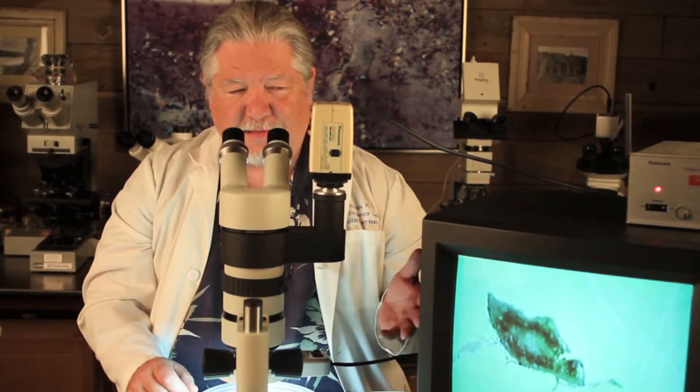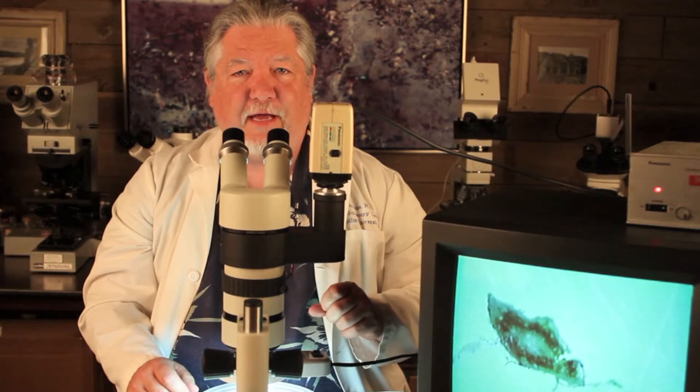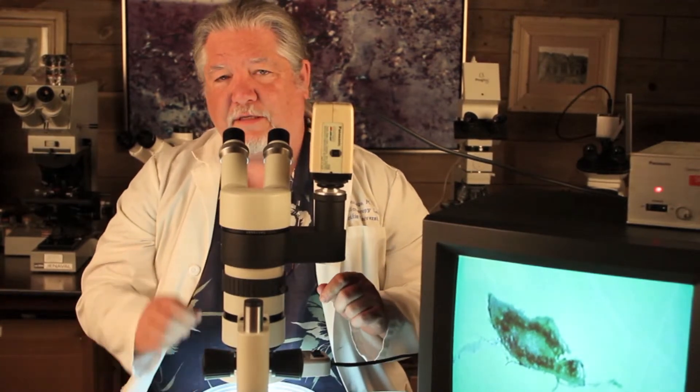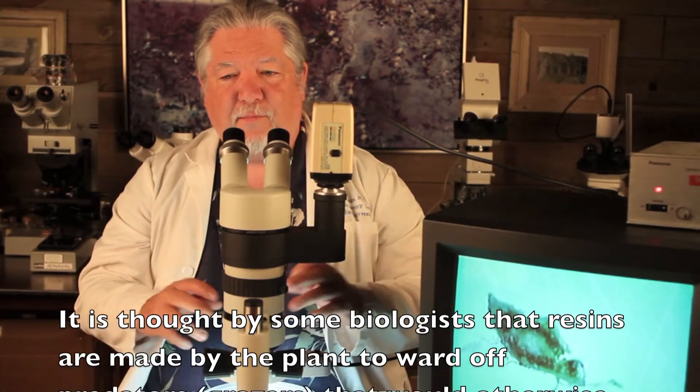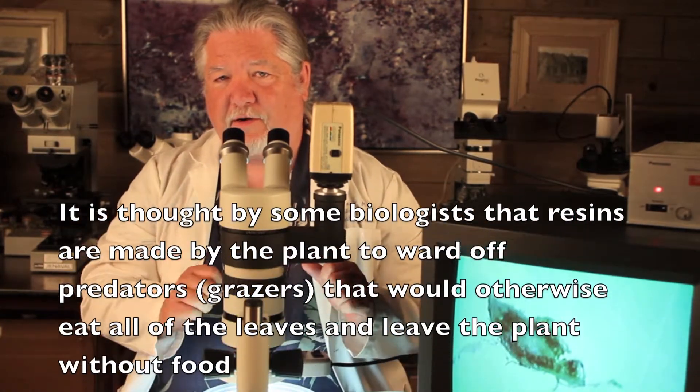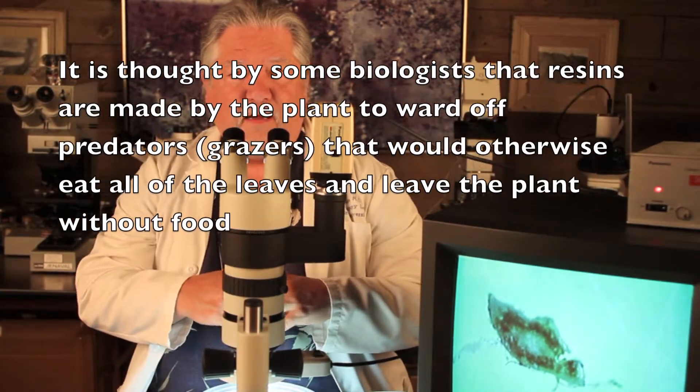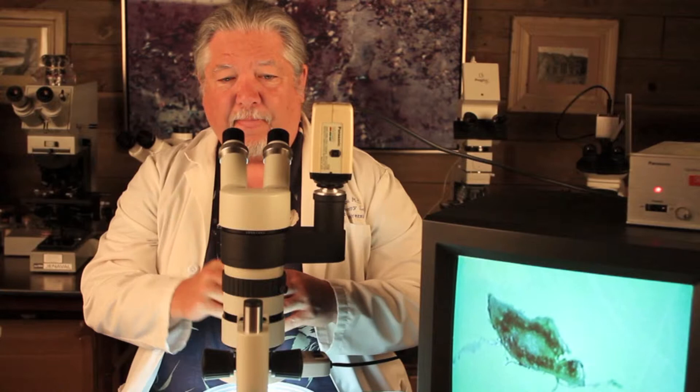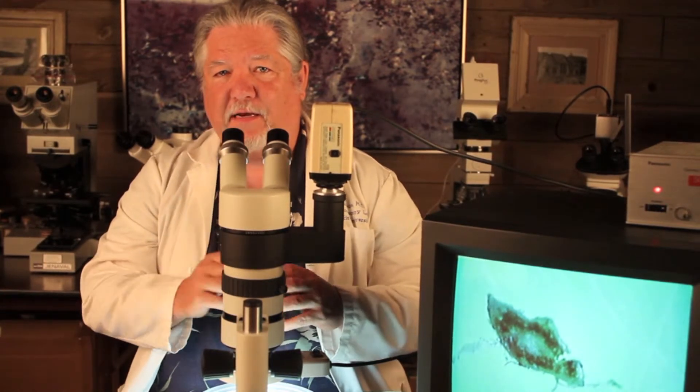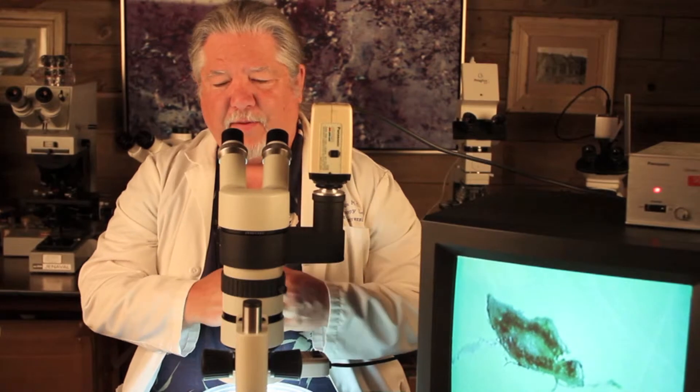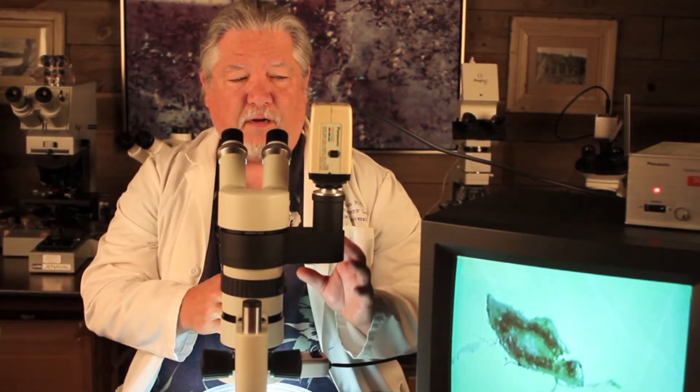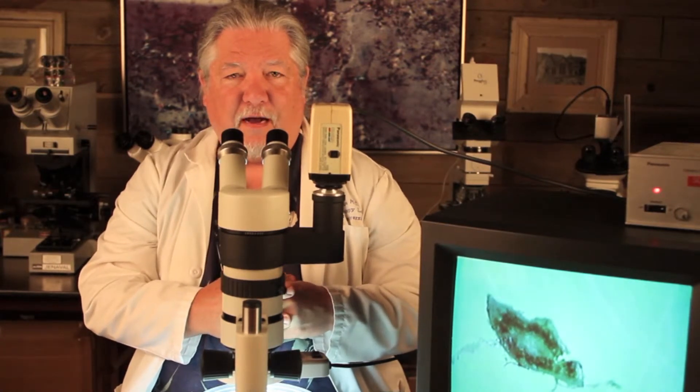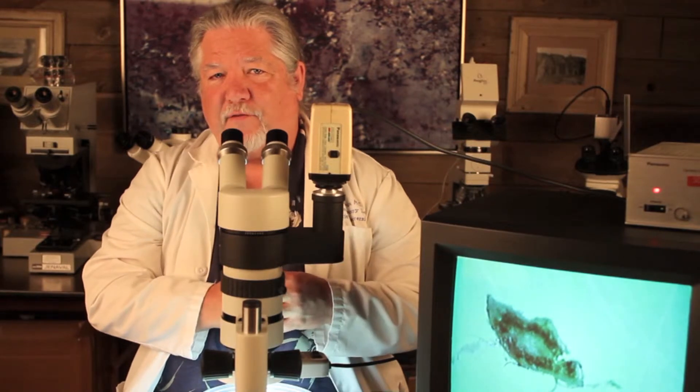So you see a cross section on the screen of the monitor here. And it's a little mangled up because I was doing this quickly for the interest of the video. However, when we look at this in high magnification, in high resolution, you're going to see the resin canals under fluorescence. They're going to autofluoresce. Remember, they glow a particular light when you hit them with a particular light. So we're going to hit them with UV light. And they're going to glow green and blue and red. And in some cases, orange, because the resins in this light up, as do the chloroplasts. The chloroplasts will be bright red. The resins will be orange and red. And then the resin canals will be a beautiful blue, a very light blue. So I just wanted to point that out to you so that you can recognize it when we see it under the fluorescent microscope.